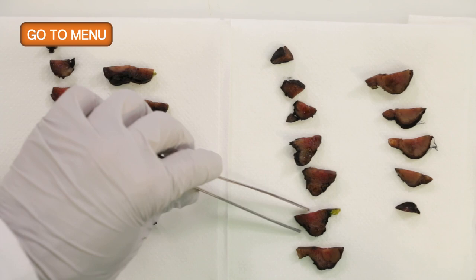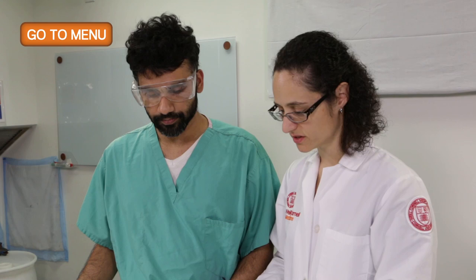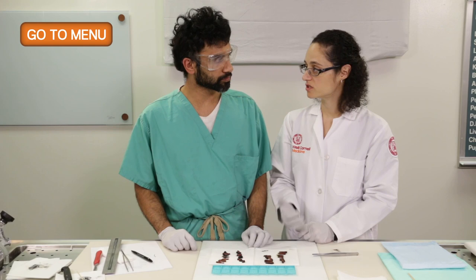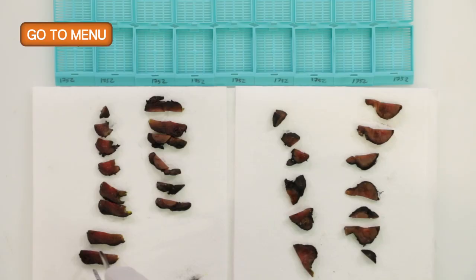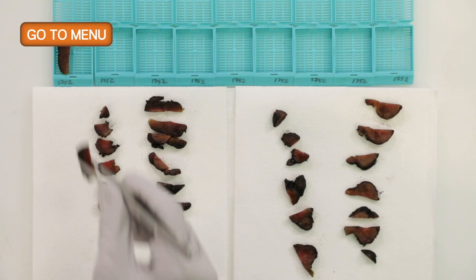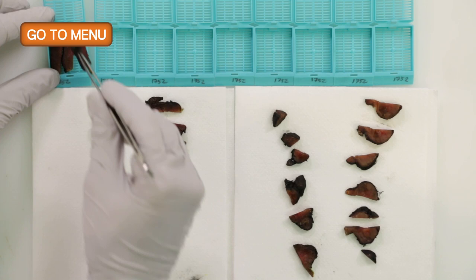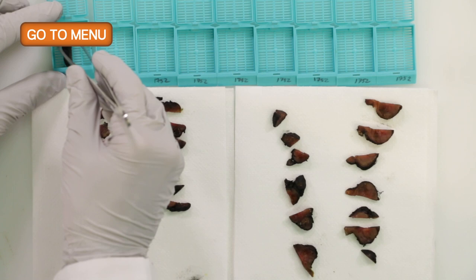Right. So now that we've transversely sectioned each half, we're going to go ahead and put our sections in the cassette. When we normally put tissue in a cassette, what should we think about? You should think about the size of the tissue you're putting in the cassette, because you don't want to put too much tissue in and overstuff it. For instance, you don't want to try and squeeze 3 pieces of tissue like this into a cassette. Makes sense. This is too much. The tissue should not be touching the sides of the cassette. So in general, it's usually 2 pieces to a cassette. They fit nicely and allow the specimen to be processed properly.